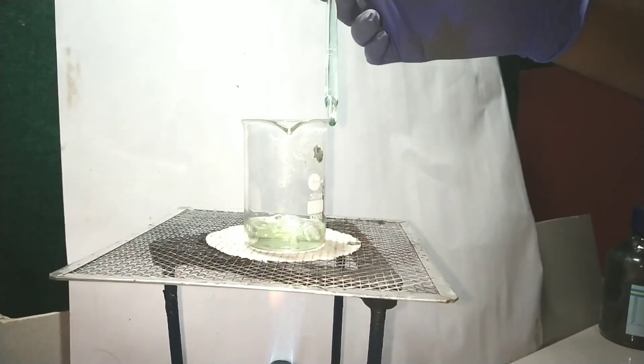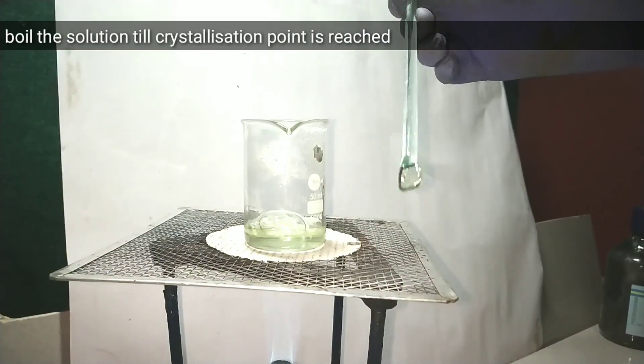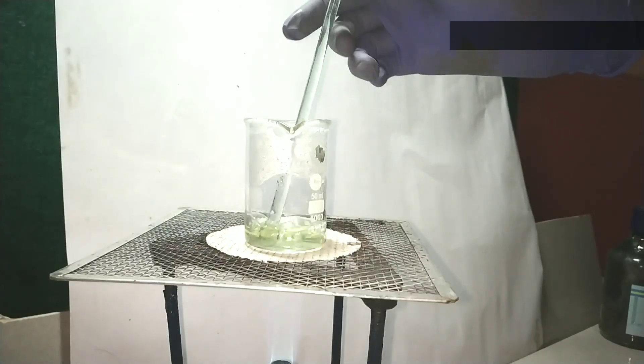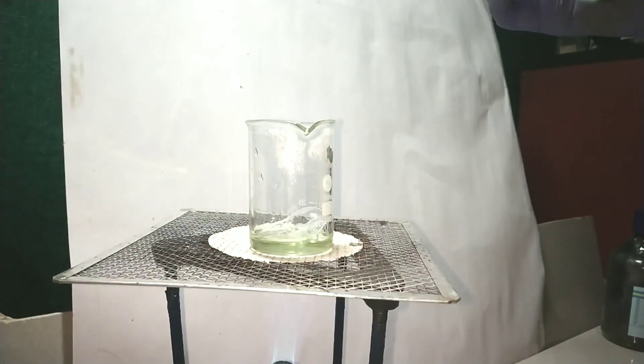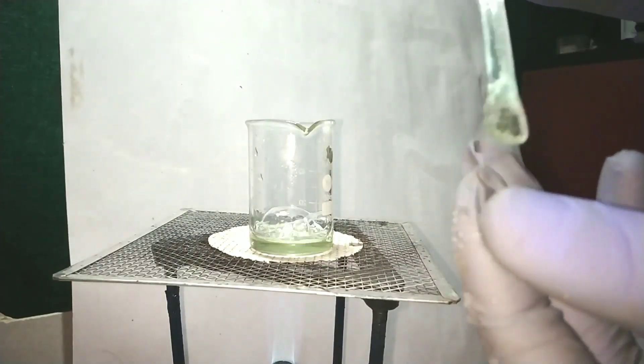After dissolving it completely boil off some amount of water until the crystallization point is reached. You can check the crystallization point by dipping a glass rod into the solution and blow drying it to cool and observe for any crystals formed.